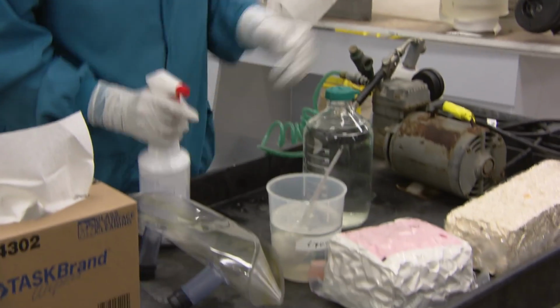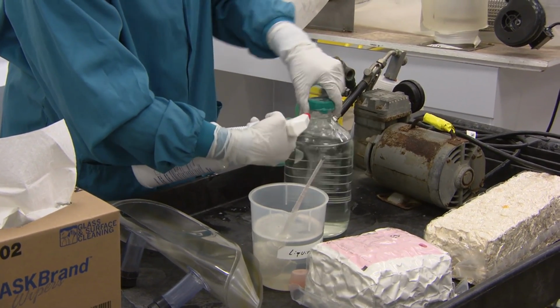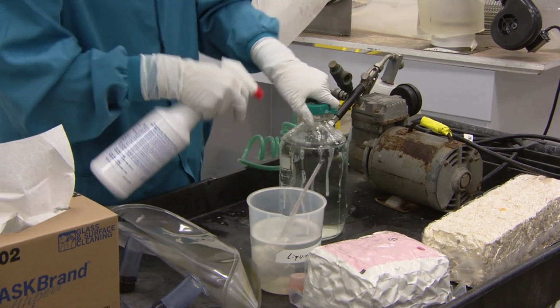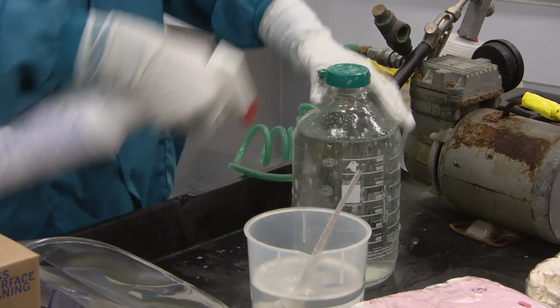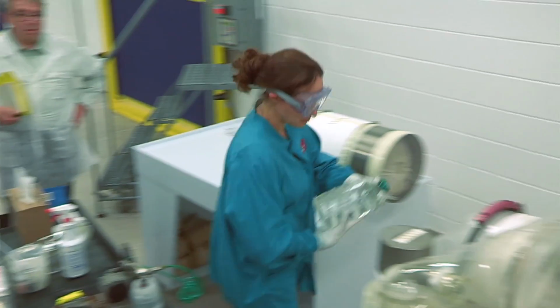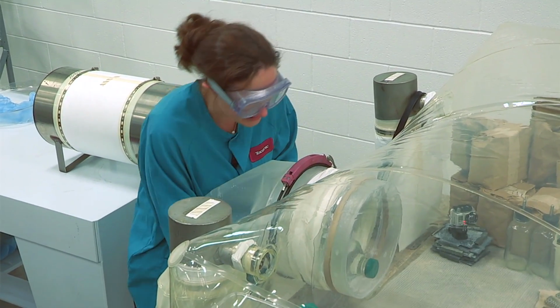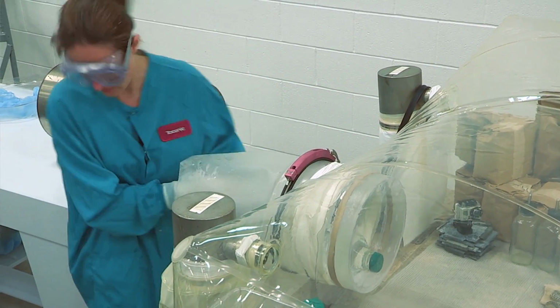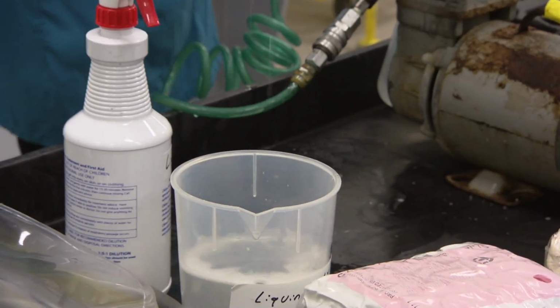And we spray the top, and then you also want to direct your spray up under the lip here, and then get all along the sides of your bottle. And then finish off at the bottom. Place this in our port. And I usually place it so the neck is facing in, it's easier to grab. And then we can finish swabbing the other half of our sleeve.